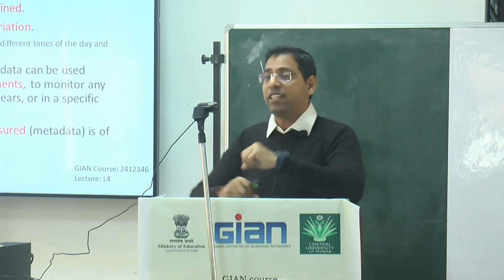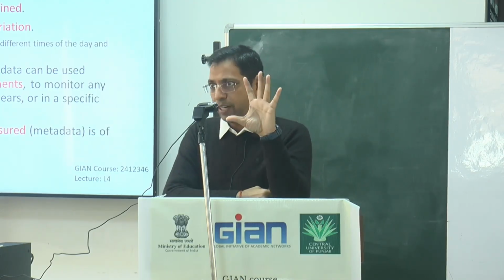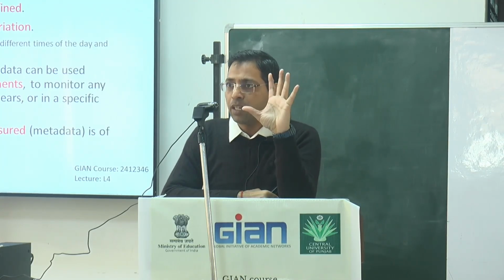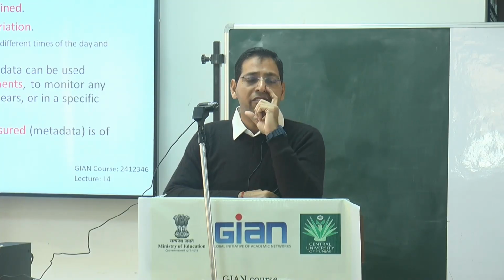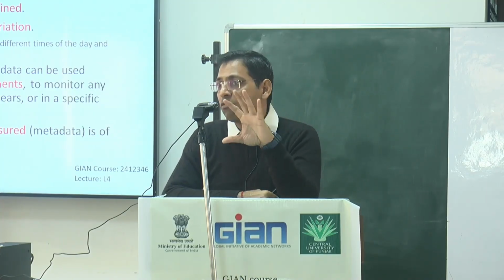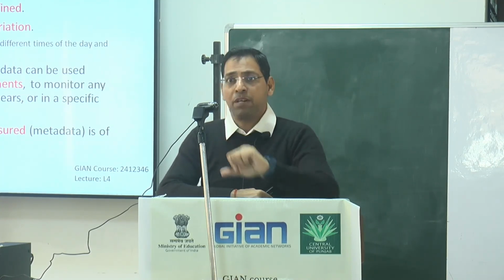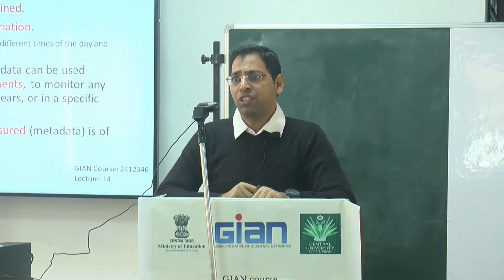So the first point, I'm starting from the first point of the NMR, and I will cover up to the end of the NMR. So the first point that we have to think of is your work. Whatever work you want to do, the first mandatory thing is the experiment. You have to design the experiment.